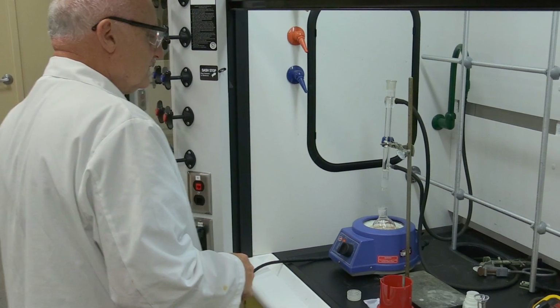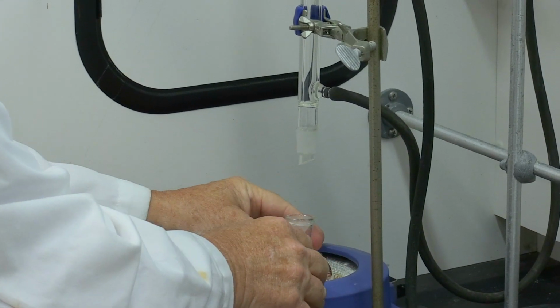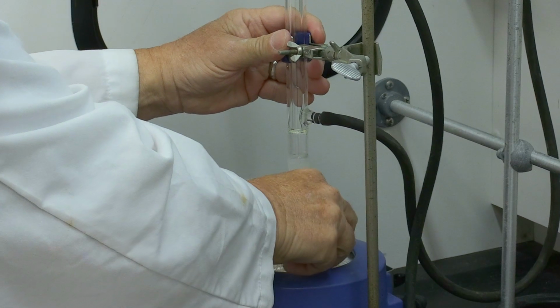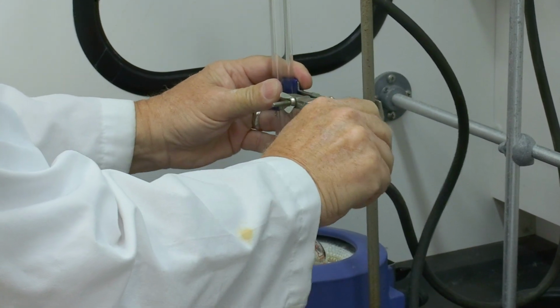Nice steady flow of water for the cooling. Attach your reflux apparatus to the flask.